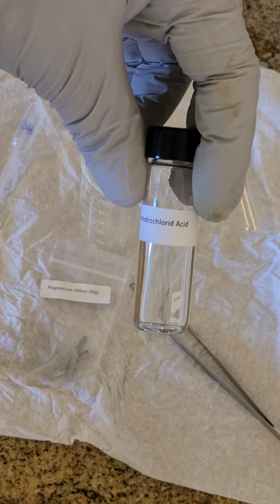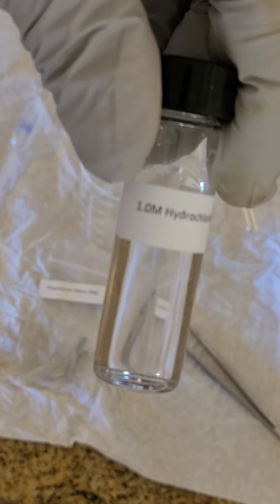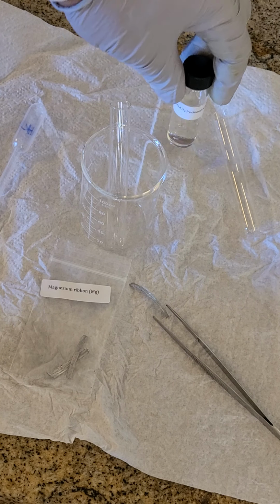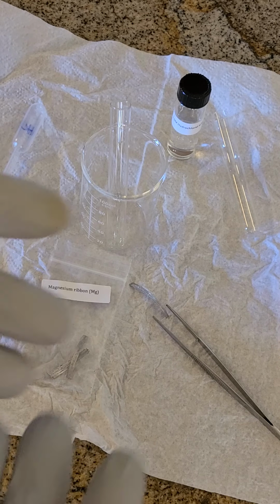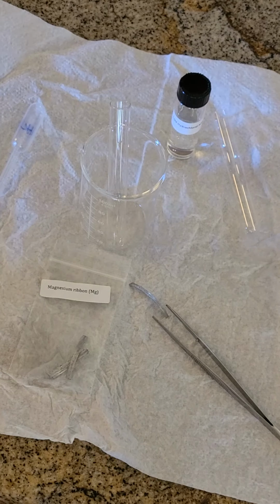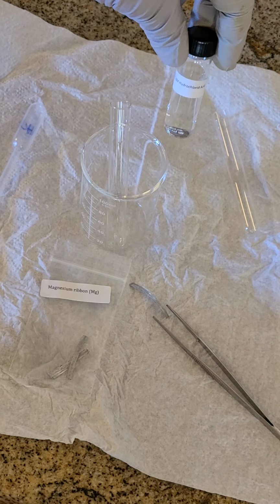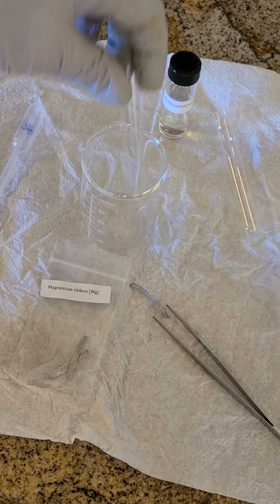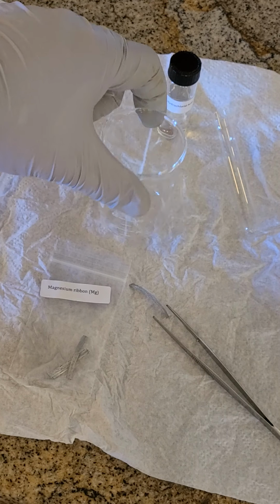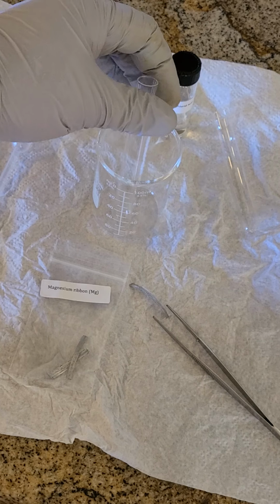Now, because we're working with hydrochloric acid, and it's a really strong acid, 1 molar concentration, we'll be learning about molarity next week. As always, wear your gloves. And you can't see me, but I've got my goggles on, so make sure you have your goggles. So we're going to take the hydrochloric acid. I like to have something to hold my test tube. Usually you have a test tube rack. We don't have a test tube rack, it's fine. Get a 100 ml beaker to hold your test tube.